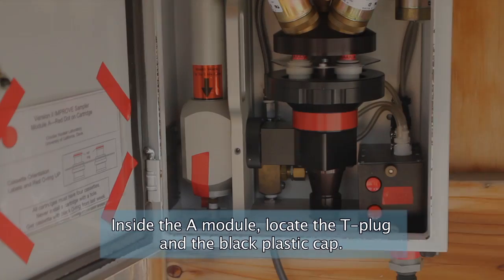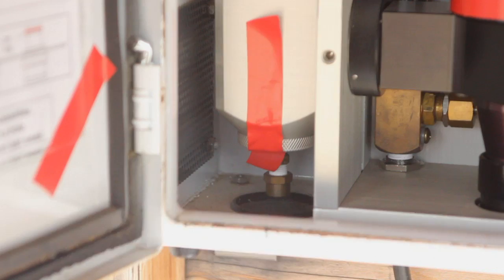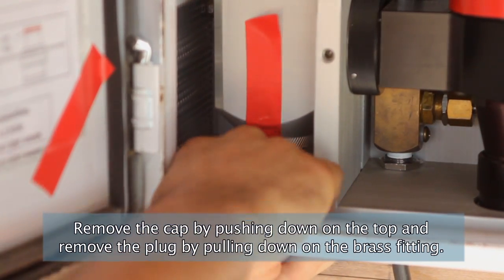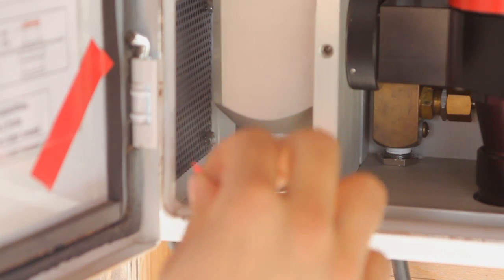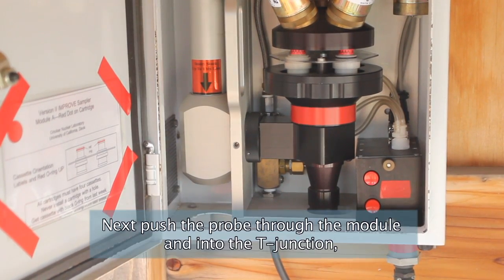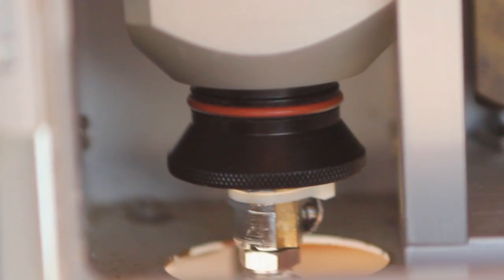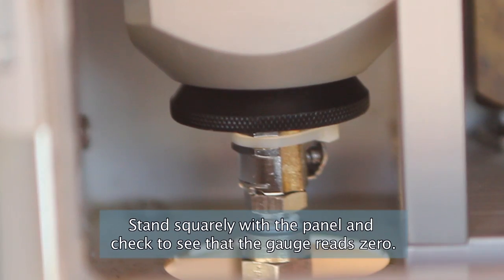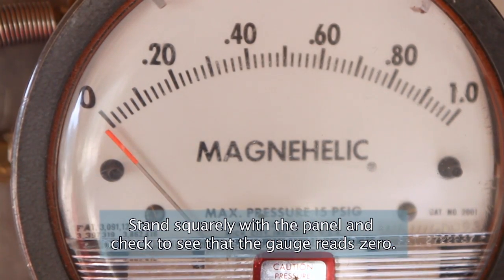Inside the A module, locate the T-plug and the black plastic cap. Remove the cap by pushing down on the top and remove the plug by pulling down on the brass fitting. Next, push the probe through the module and into the T-junction, bottoming out the probe. Stand squarely with the panel and check to see that the gauge reads 0.